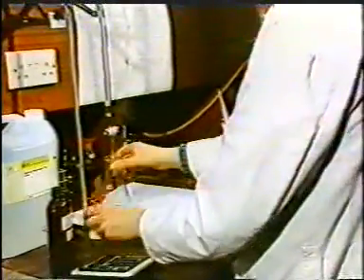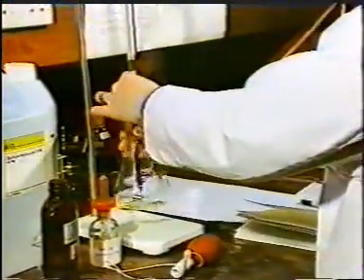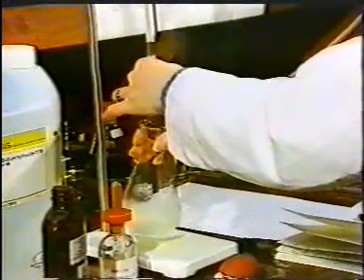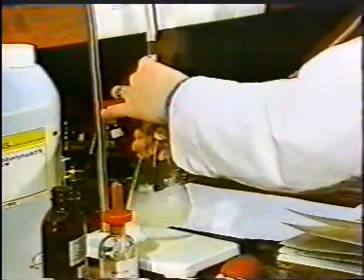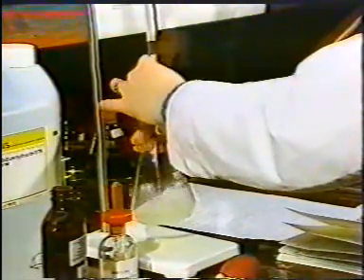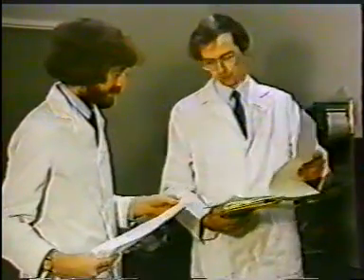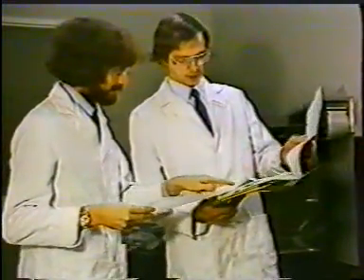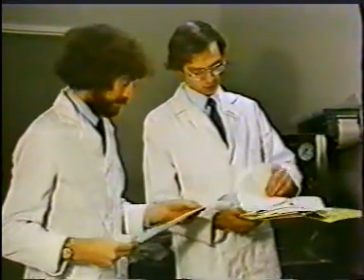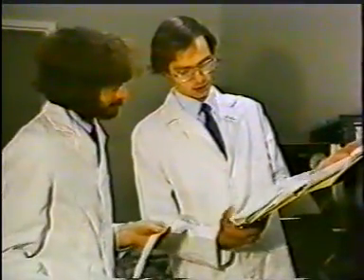Quality control staff are involved with testing raw materials, packaging materials and products to determine whether they comply with required standards. Both chemical and microbiological testing are undertaken. The quality control pharmacist, however, is concerned with much more than simply providing an analytical service. He must be able to discuss any production problem which may arise, and he is involved in monitoring the manufacturing unit in various ways.